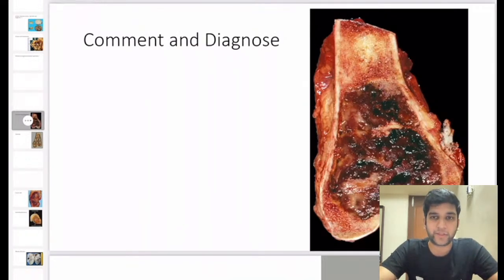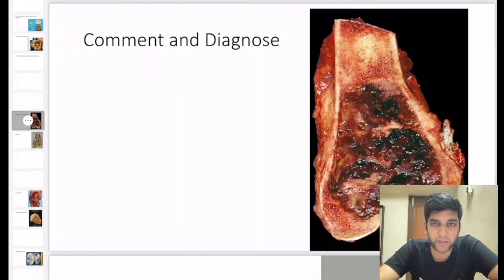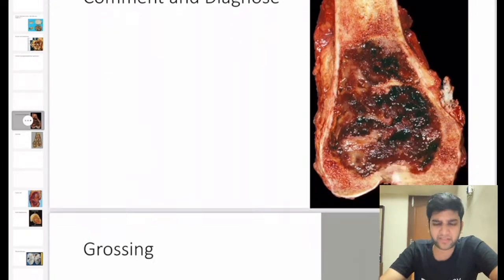Yeah, diagnose. Okay, your diagnosis. It's a very simple and straightforward case.